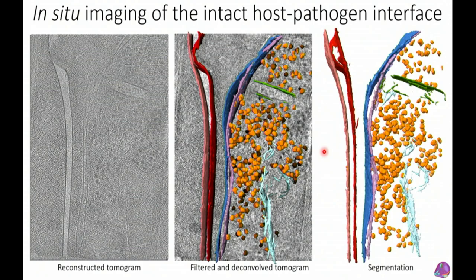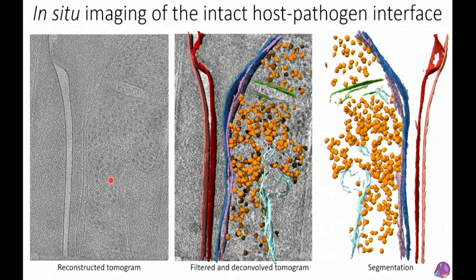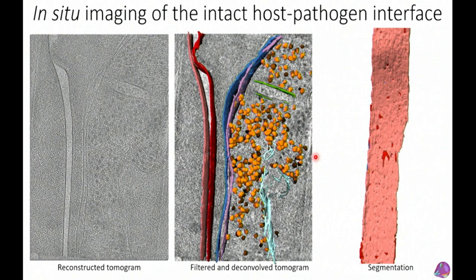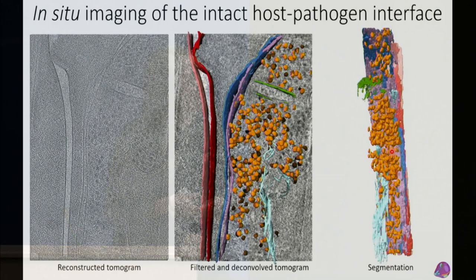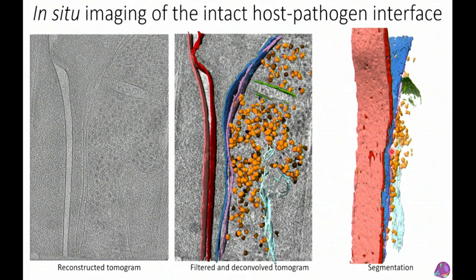Neural network segmentation gives us a 3D colored reconstruction of the ultrastructure inside the cell — far easier to interpret than squinting at low-contrast grayscale images. Each one of the little golden potato shapes is a ribosome, exactly as it exists inside the undisturbed cell. However, as a single-particle person used to sidechain-level resolution, these potato shapes are a bit disappointing.